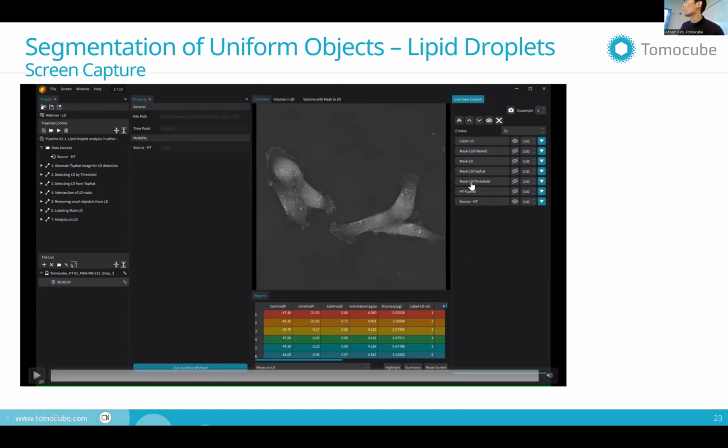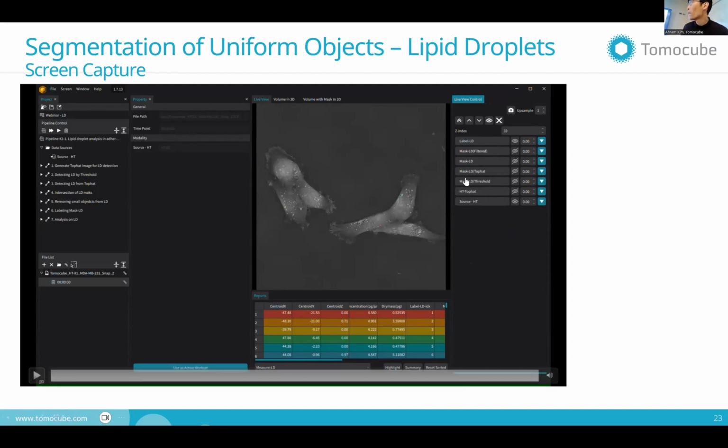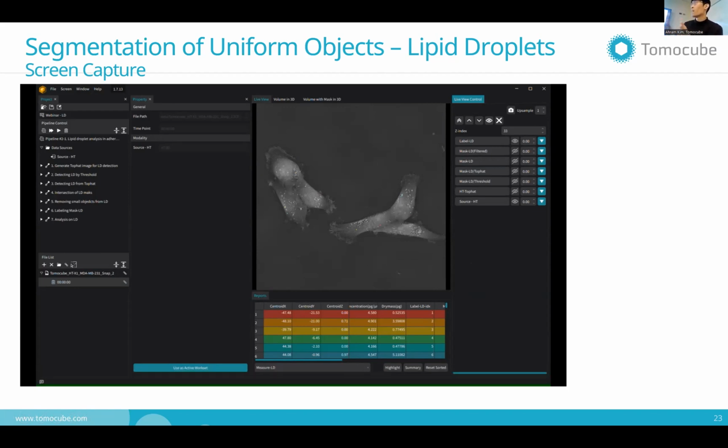By these outputs, you can tell which processes were satisfactory or acceptable for the analysis. By combining those results, you can see the final result. Also, you could see that the segmentation result is applied to the visualization to see a three-dimensional representation. In that way, you can get a better idea about what you get from the analysis.